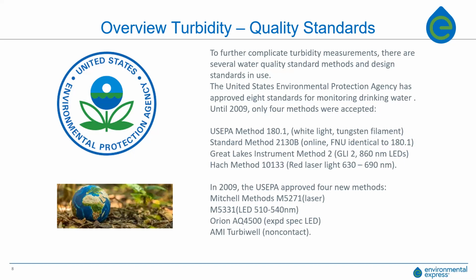With regulatory compliance important in the municipal drinking water application and water treatment plants specifically, measuring turbidity can also help keep costs down. As I mentioned, clarifier settling rate optimization is key, as well as filter bed backflushing and monitoring for breakthroughs within that system.